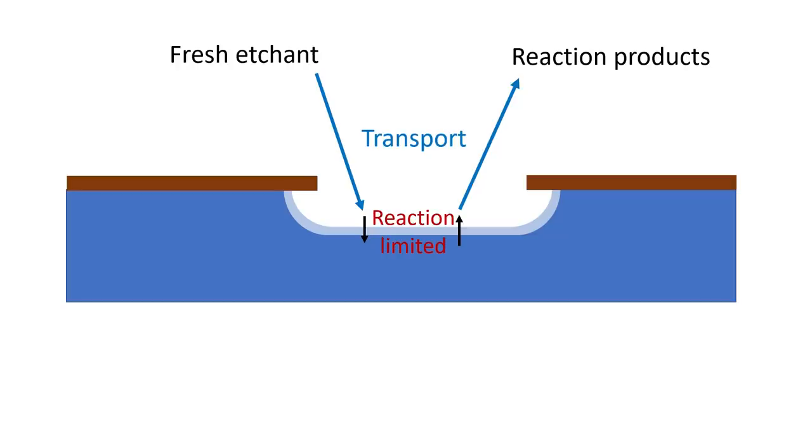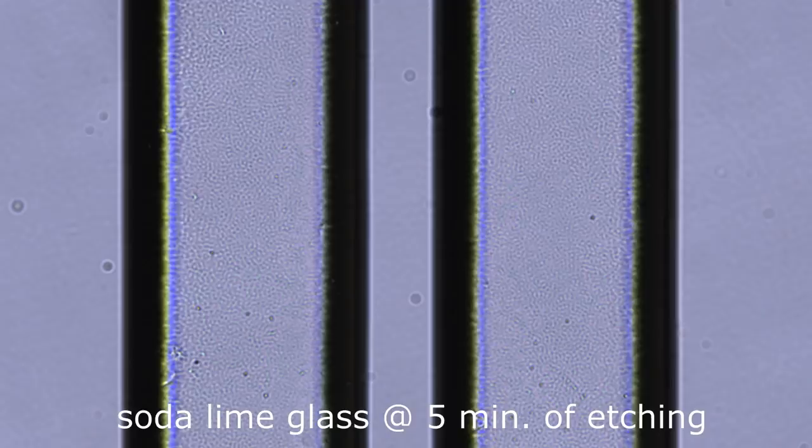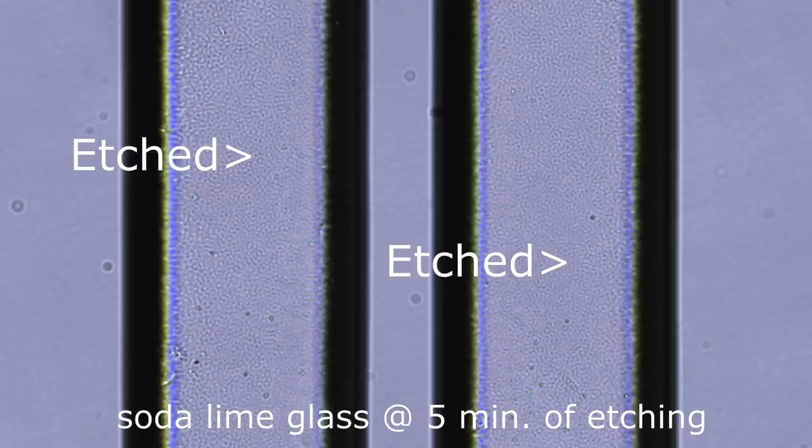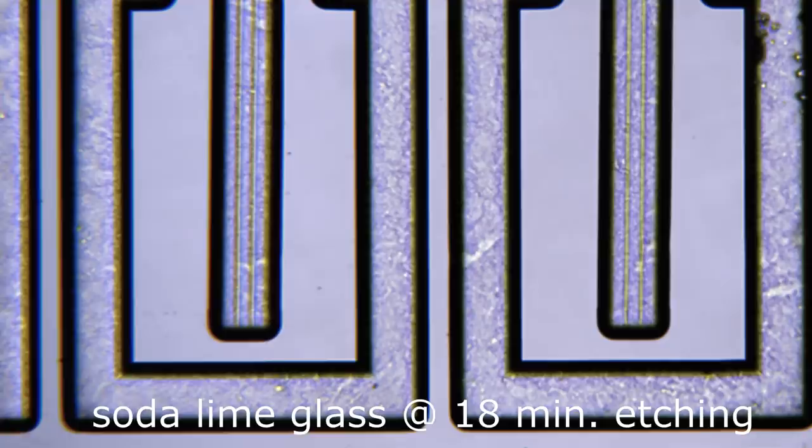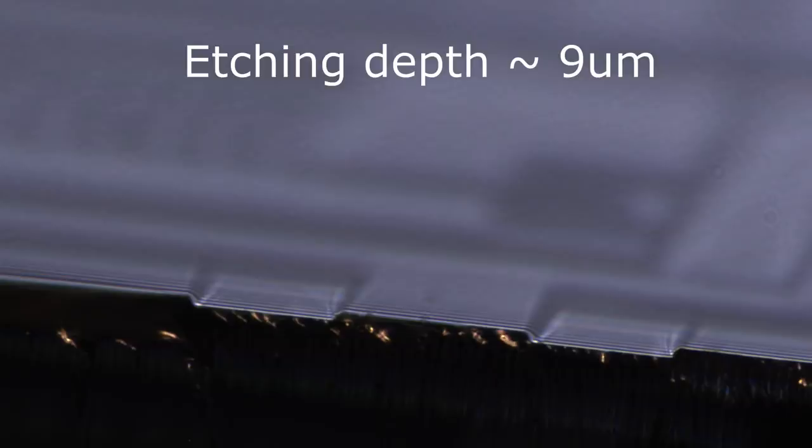So here you see a comparison of the original pattern and the etching result. You can see that the central areas in the etched surfaces are flat and the edges are sloped gradually, exactly like you would expect with isotropic etching. Also, you observe some increase in surface roughness in the etched areas. However, it doesn't look too bad. But it gets more obvious with extended etching time. And here you see a cross section of the etching profile which was made by cutting up the sample.